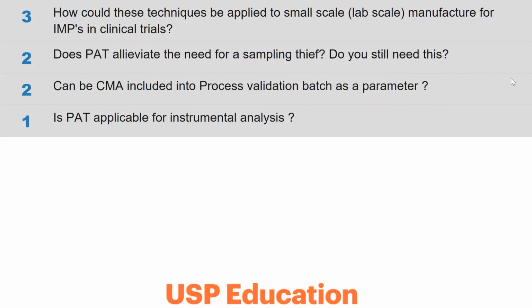And what you need to do when you're qualifying your process analytical technology is have a sampling port where you can manually take a sample at the same time that the process analytical tool is monitoring, to compare.